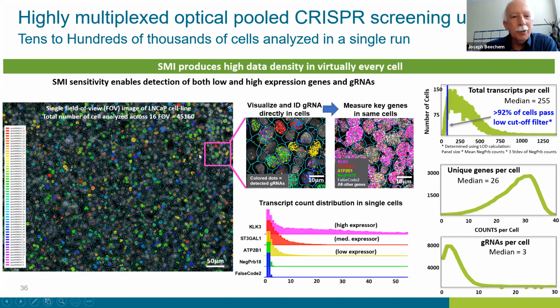It's sort of like what it looks like, how many total transcripts. When you do these kinds of screens, what you see is that I got rich data on greater than 92% of all the cells that I'm measuring. And if you ever do this with CRISPR-Cas9 at the single cell level, you get nowhere near a 92% success rate on reading those cells. It's way, way down, as some of you perhaps know.